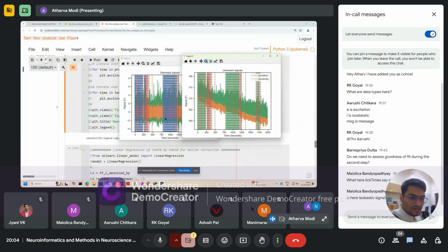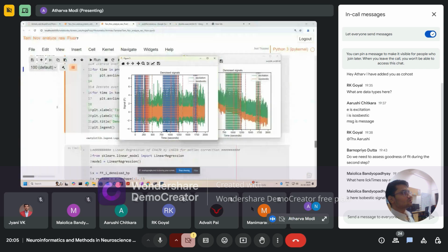So if I want to explain in simple terms, for any signal, the mean of the signal is a 0 frequency term. So basically, if you apply Fourier transform on it, like what Deepak taught in last lectures, if you convert this signal from time to frequency domain, then the mean of the signal will come at 0 frequency, and around that the other frequencies will be added up. It may be a little hard to understand if I am not showing any plots, but we'll cover it in the signal processing section, how this high pass filter works. But basically, these slow noises which change the mean of the signal are removed, and this flattens the signal to a mean value of 0.